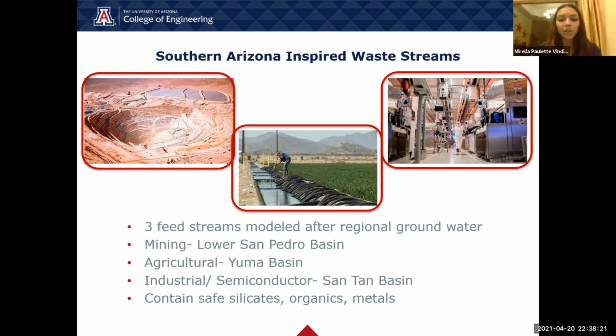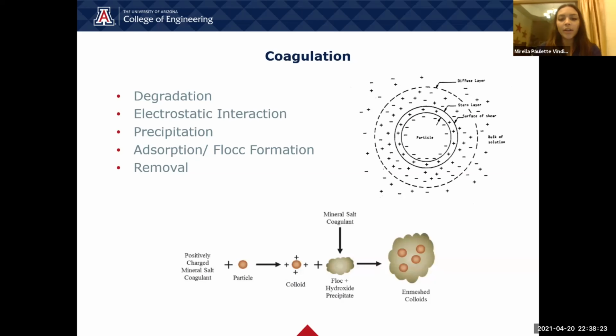Coagulation captures colloidal particles governed by surface chemistry in the untreated water, using chemical reactions and electrostatic interaction to come together as floc. 2 classes of materials are removed by coagulation: turbidity and color. As the multivalent ionic coagulant degrades, colloids are destabilized in solution and floc begins to form within seconds of mixing. Therefore, the coagulant and the untreated water are first rapidly mixed to ensure exposure of all fine particles.